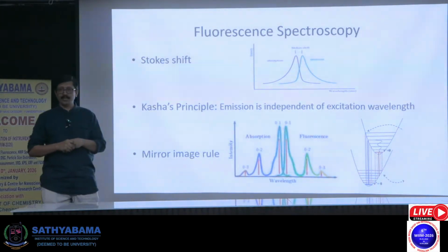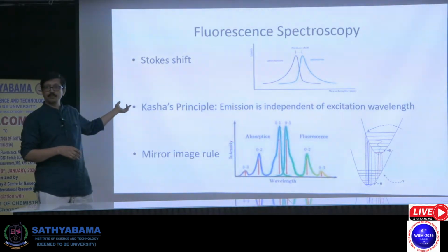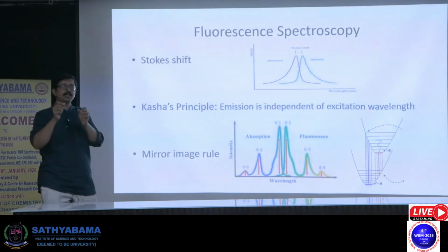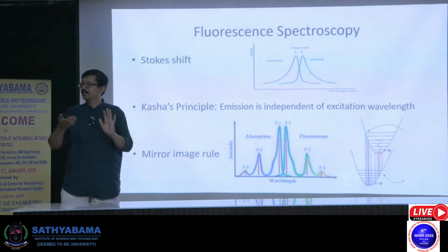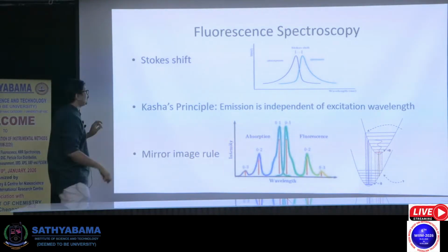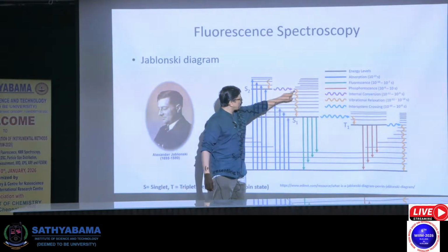Energy loss is happening. That is actually evident from the previous spectrum. If you can go back to the previous slide, it shows that some energy loss is happening in the form of heat after light absorption. Look at the process carefully. After the light absorption, there is a fast process.